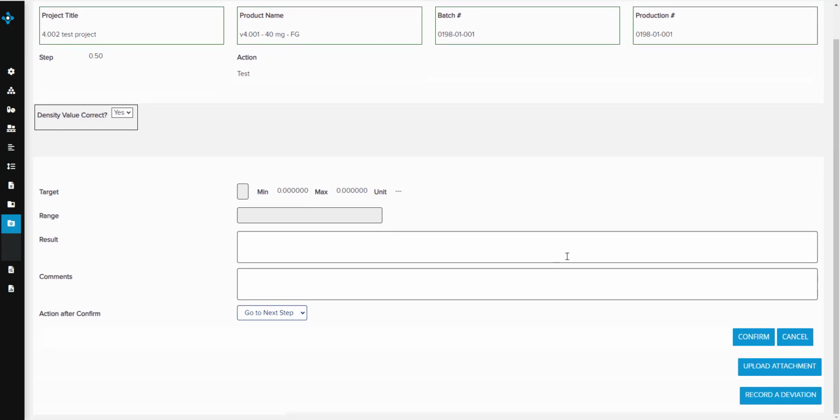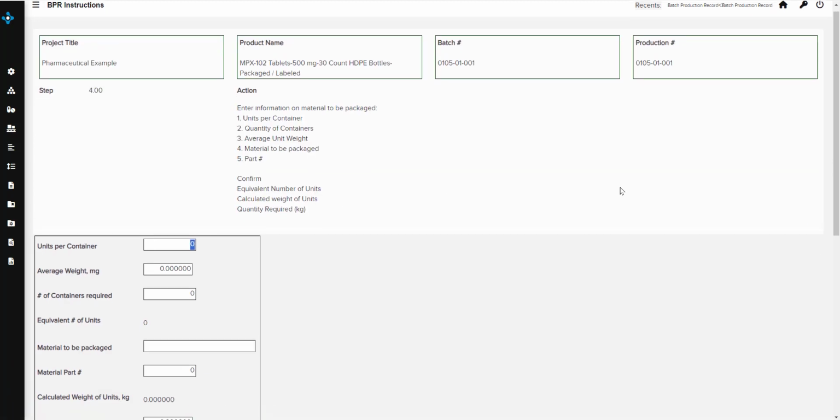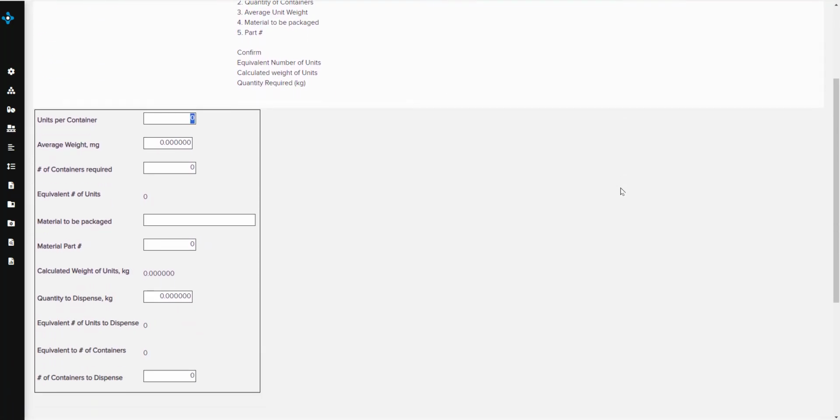These are just a few examples of our dynamic fields in action. Their primary purpose is to not only record data, but also streamline external operations and enable informed decision-making.